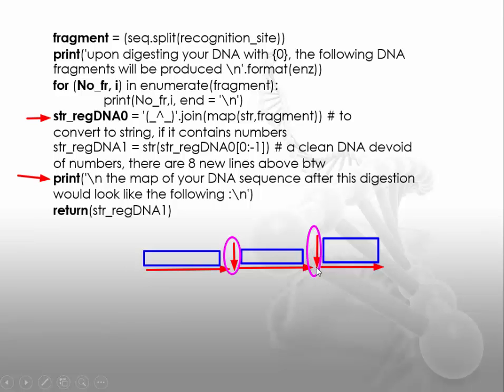You could write the name of the enzyme, like you could write down XbaI here to show that you've cut it with XbaI. This is particularly important if you want to have a general idea of the map of your DNA if you cut it with a single enzyme. And believe me, it is very helpful to do it, and sometimes on certain occasions you would need to see how the enzyme cuts the DNA before running a gel electrophoresis in the lab. And having your own software for your own enzymes could be a relief.